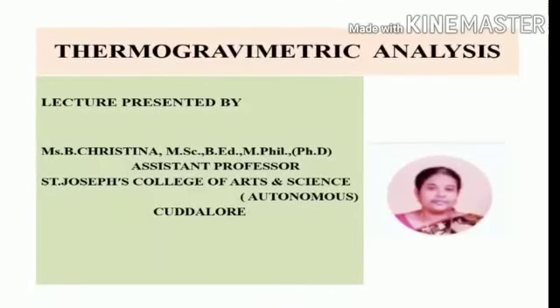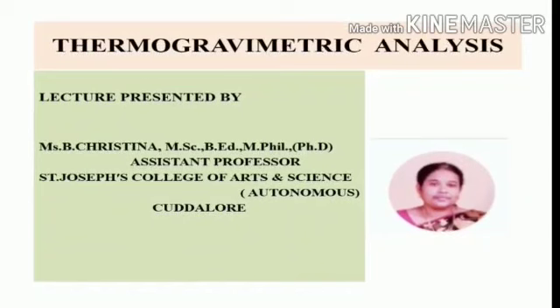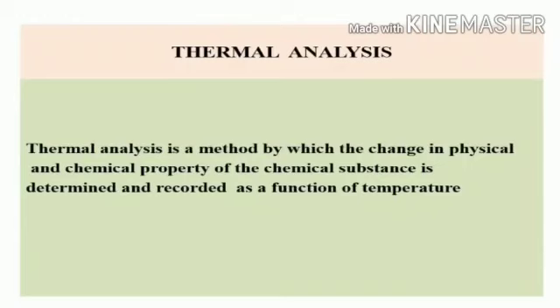In this module, we are going to discuss thermogravimetric analysis. Thermal analysis. When matter is heated, it undergoes certain physical and chemical changes. The physical and chemical changes take place over a wide temperature range. Melting and boiling are physical changes.